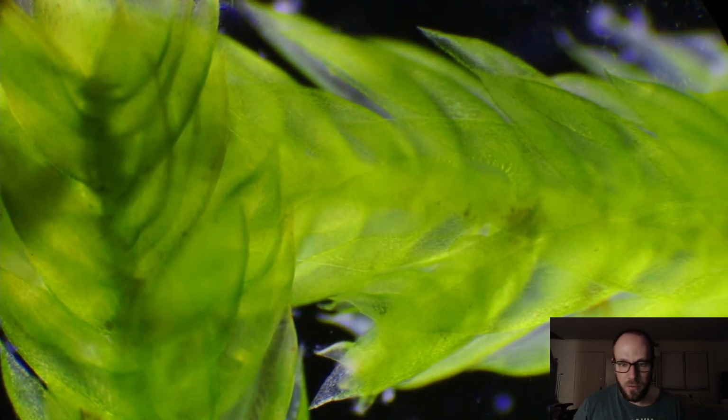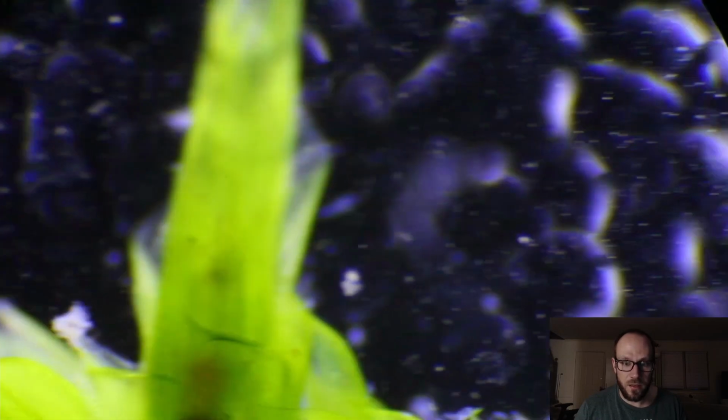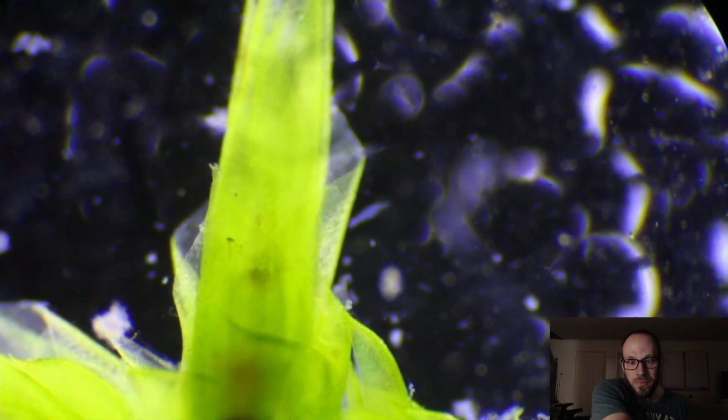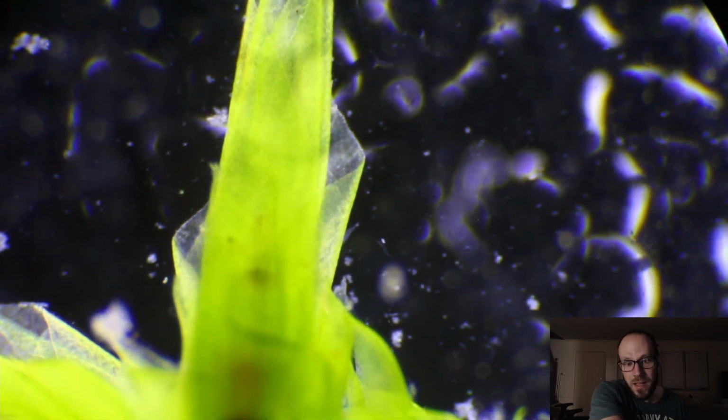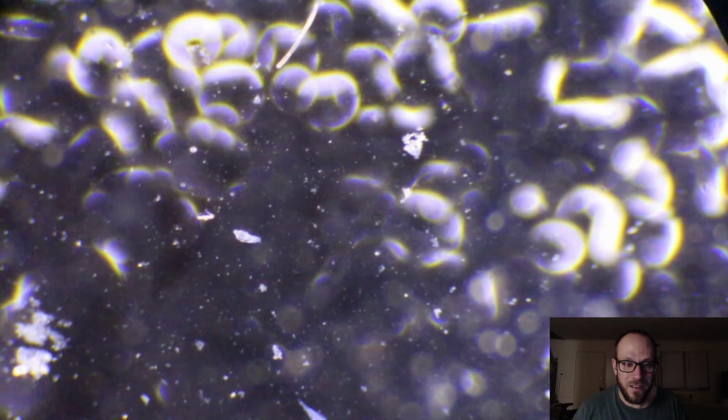I was saying earlier before you got on that I'm waiting to accidentally injure myself, because I'm not going to intentionally do it, but when I'm at home, if I accidentally injure myself at some point, I will be collecting blood to look at on here. And 1000x will definitely be used when I do that.